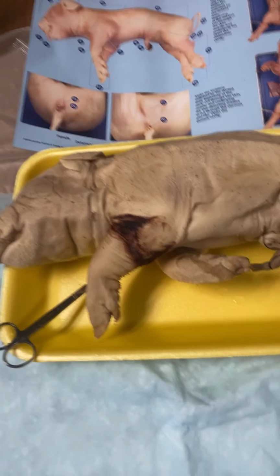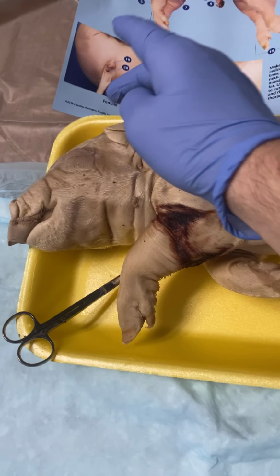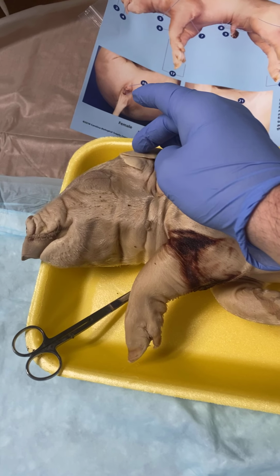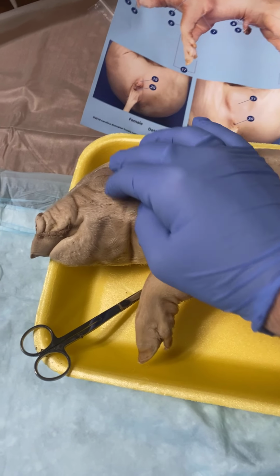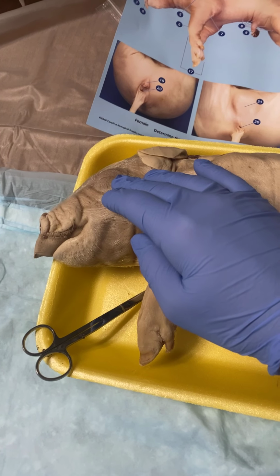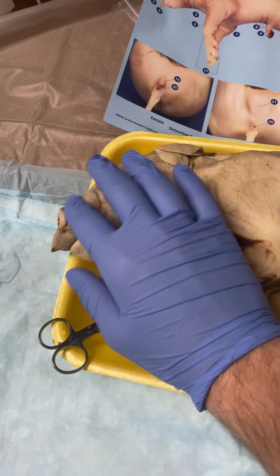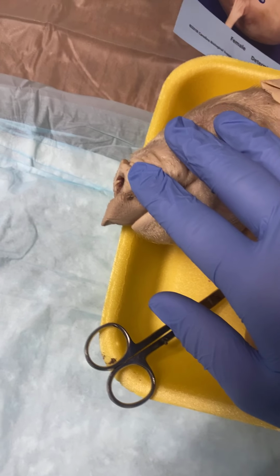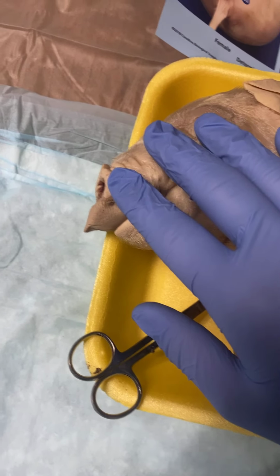Now, the first structure of the pig that I'm going to point out is the pinna, which is the external ear. It channels sound waves into the ear canal. Next is the eye, which is the organ responsible for vision. Next is the nares, or the nostrils. It's a paired opening to the nasal cavity for passage of inhaled and exhaled air.